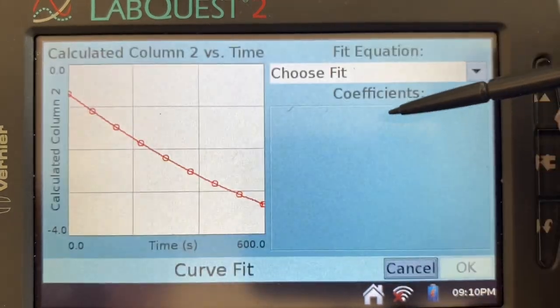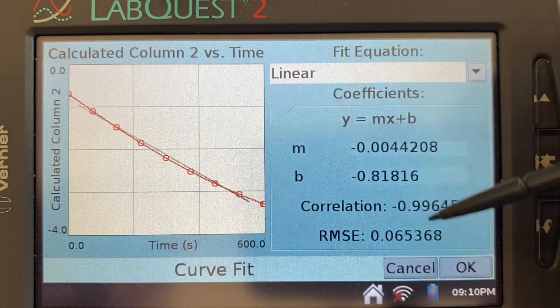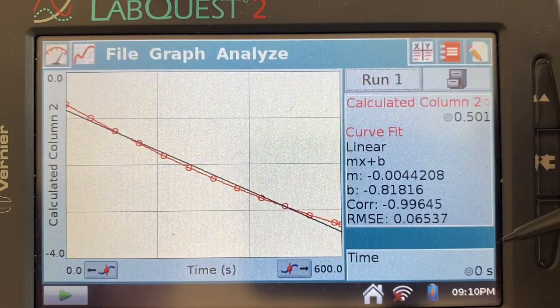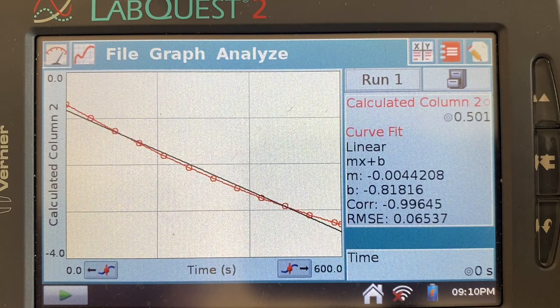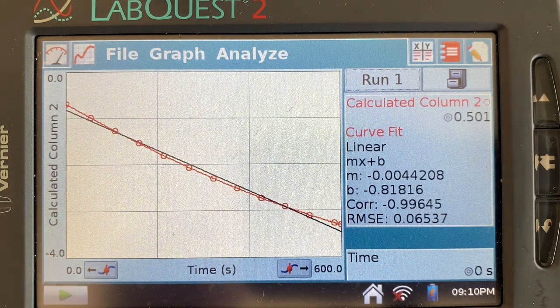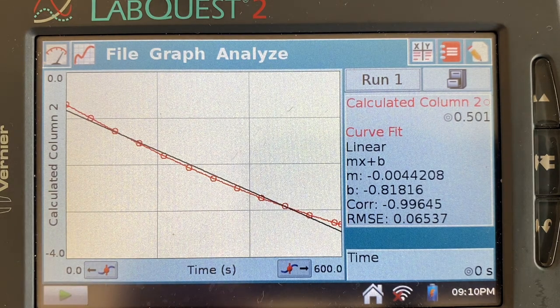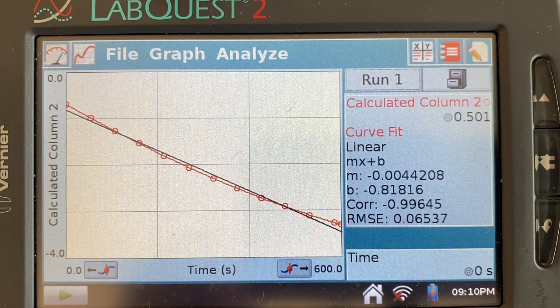So let's make sure we get a little line on there. Okay. All right. So I can see by this that it is pretty linear. Again, not perfect, but of course it's lab data, so you have to expect a little bit of inaccuracy.